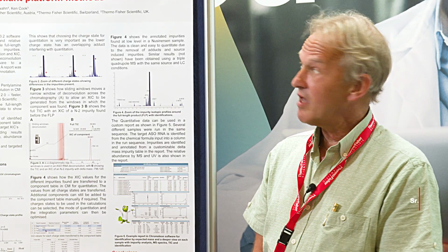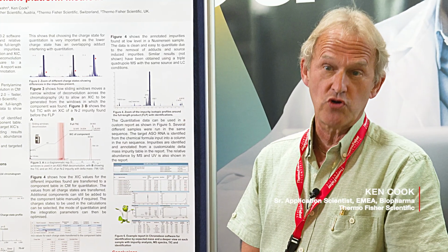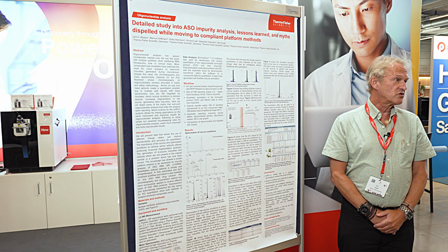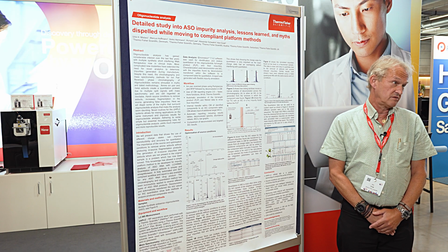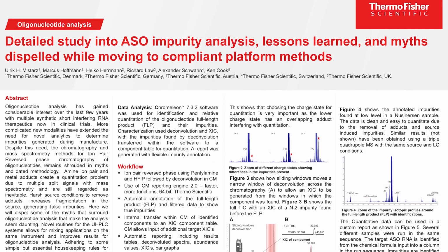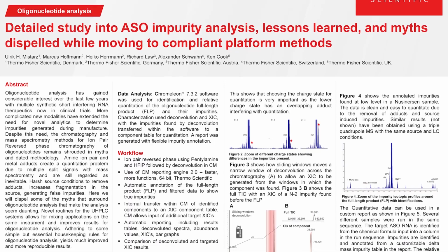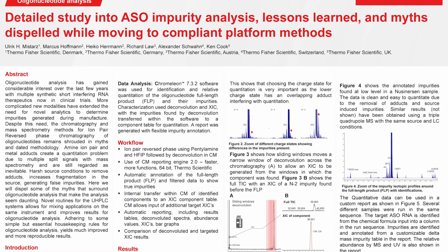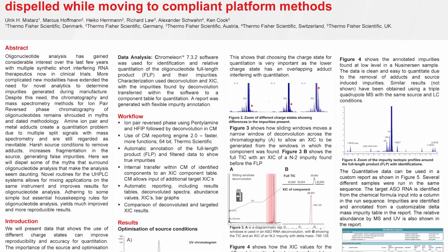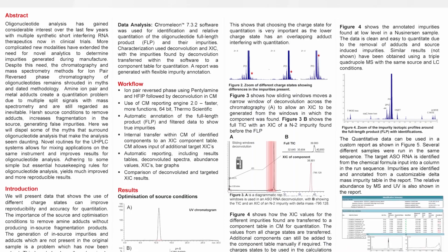Yeah, this poster is about the detailed study of ASO impurity analysis. It's a difficult task. There's a lot of new drugs coming out in pharmaceuticals, and this is how we develop the methods. The difficulty in this analysis is there are some methods out, but they're difficult. I'd like to produce a method that's easy to do, that's easy to transfer from laboratory to laboratory, and a lot of these methods now need compliant reporting.